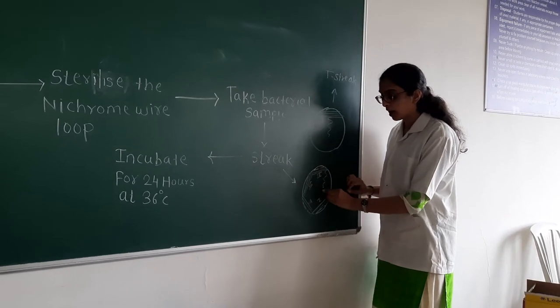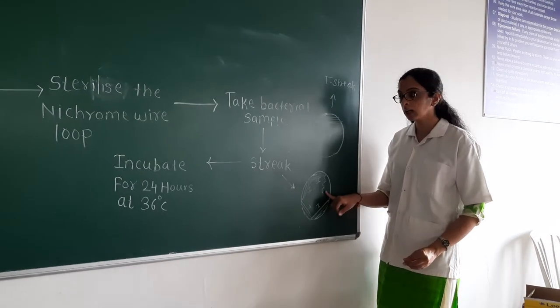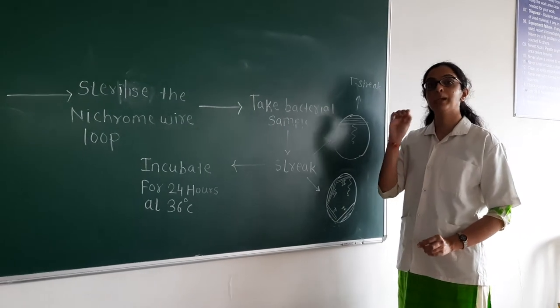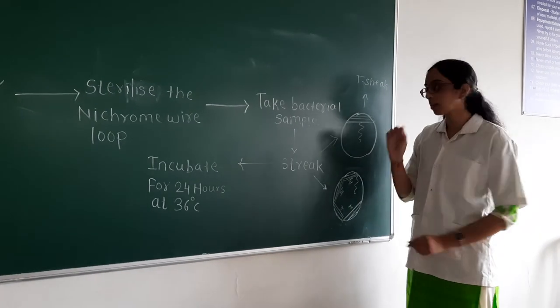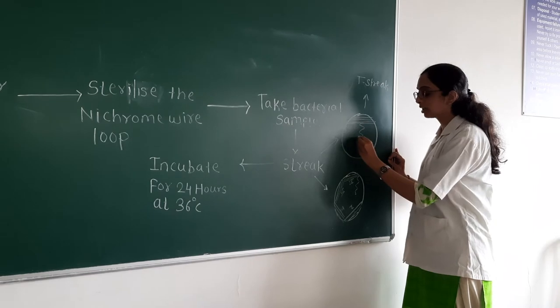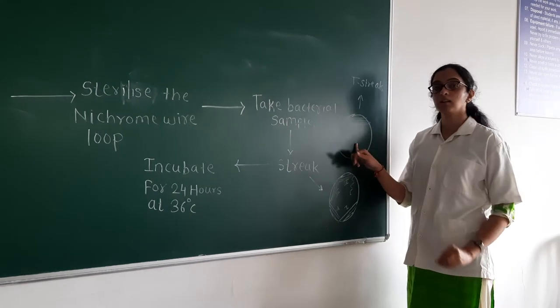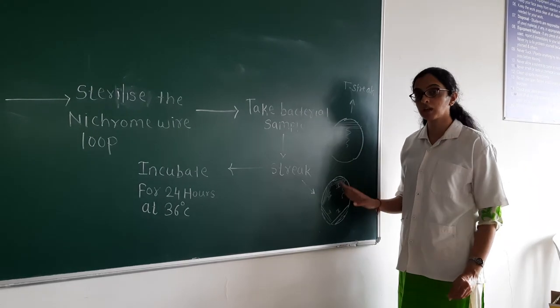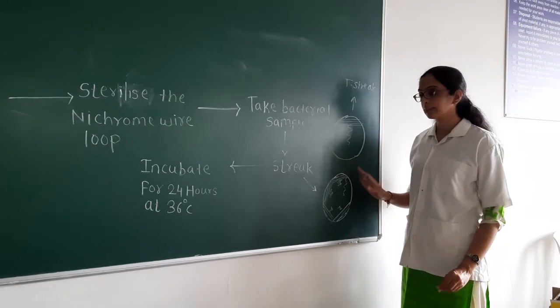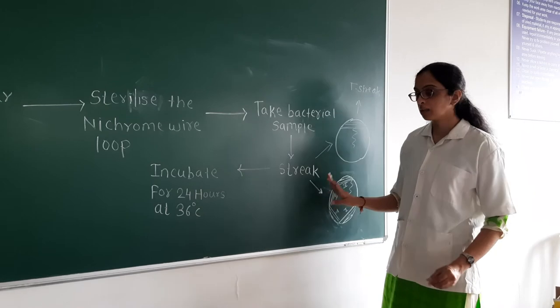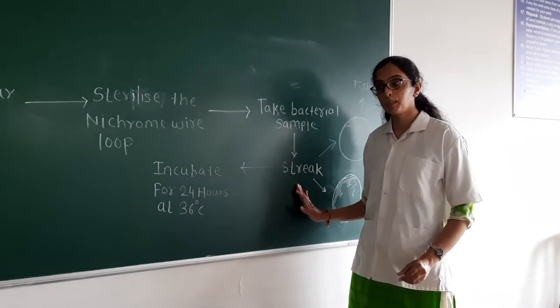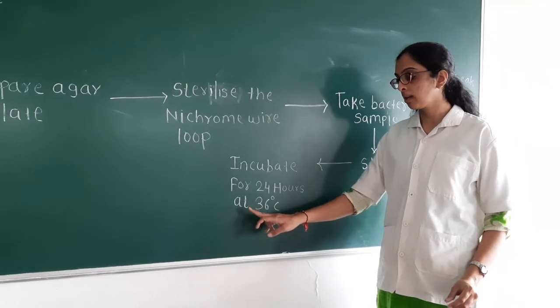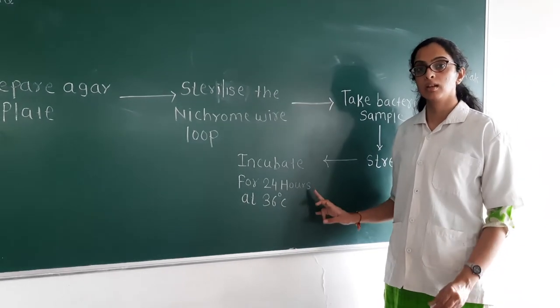Similarly for the T-streak, you take the bacterial sample only once, streak it, and then streak it in a zigzag line. That is the major step in the streak plate technique. After streaking, close the plate and then incubate it for 24 hours at 36 degrees Celsius.